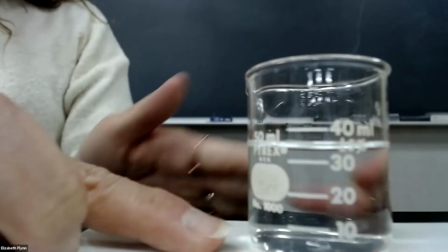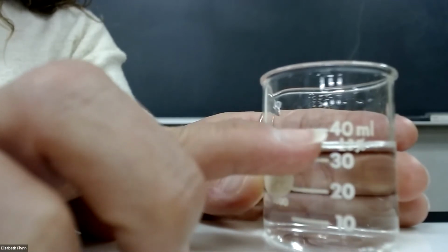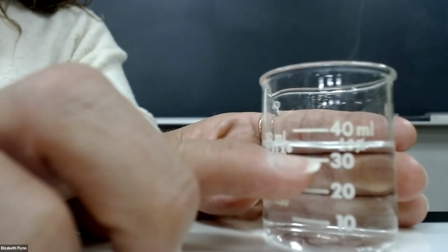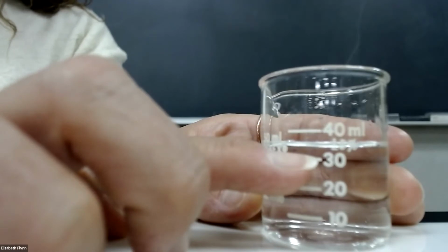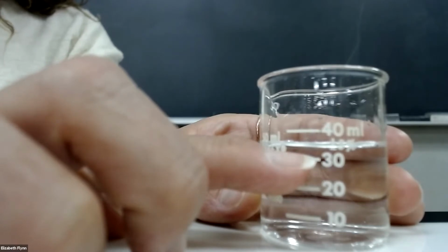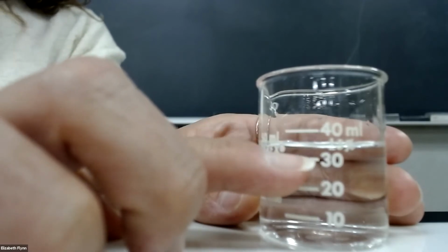All right. So it doesn't look like I can get it more focused right now, but that's okay. When we have our readings here, we've got a beaker that has graduation marks at 30 milliliters and 40 milliliters. There's no in between. And remember that the first estimated digit is the last digit that we report in a measurement. So we know for sure that there's at least 30 milliliters in the beaker, but we don't have any numbers in between telling us that it's 31 or 32 or 33, etc. So we have to guess. We have to estimate the level of the bottom of the meniscus in between 30 and 40. So that is the last digit that we can report.